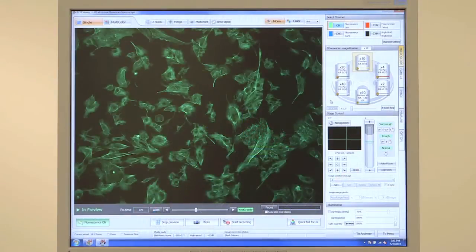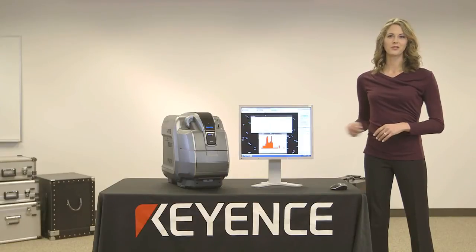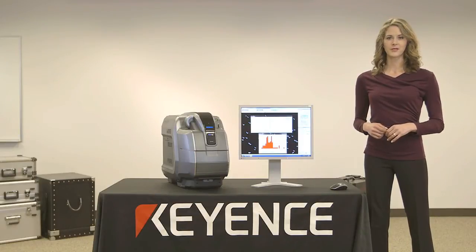Here in the viewing software, to select a fluorescent channel, just click the appropriate icon. This was just a quick overview of some of the unique features of the BZ9000 All-in-One Fluorescence Microscope.